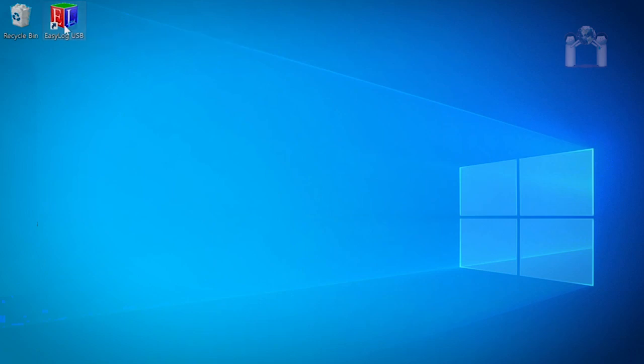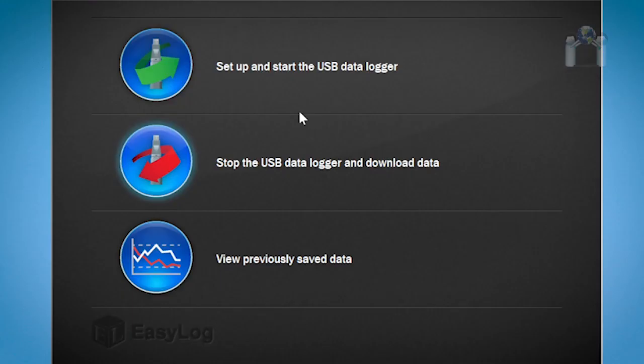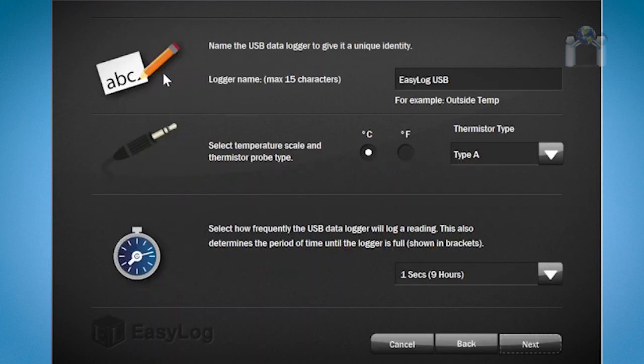After a few moments, a menu should appear. Select the first option: Set up and start the data logger.